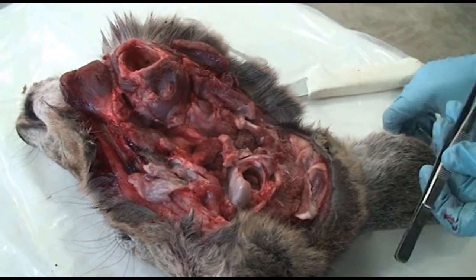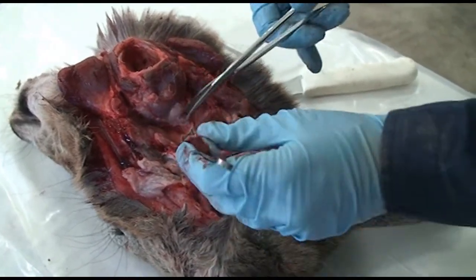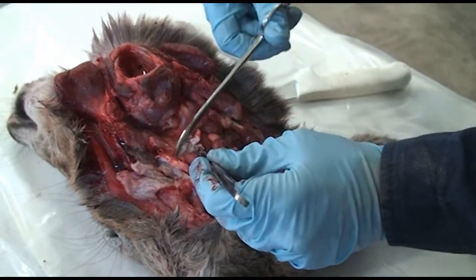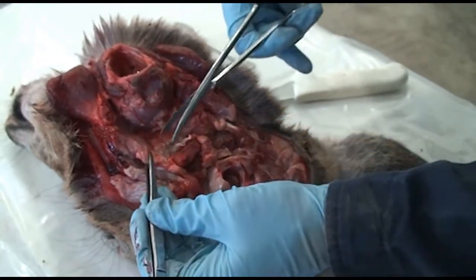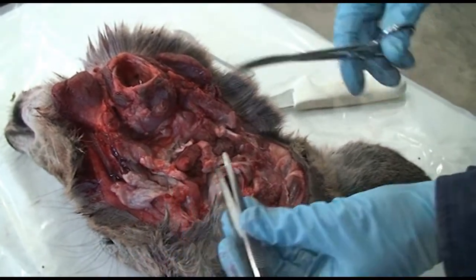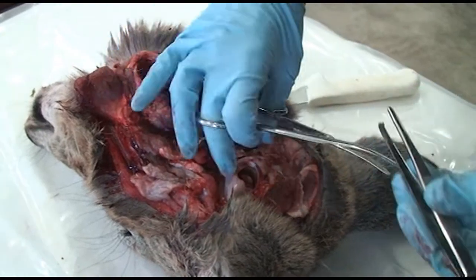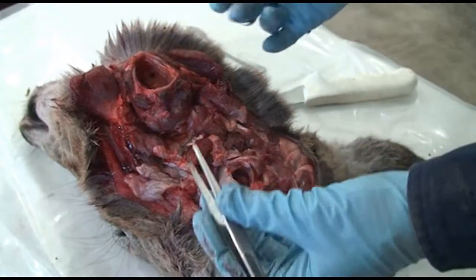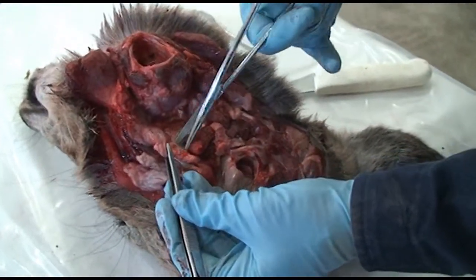And so I like to use my scissors and dissect down to the lymph node till I see that capsule, and then grab a hold of it and dissect it out. Some people like to use a knife to get the retropharyngeal lymph node out. There'll also be lymph nodes when you're taking the head off. You may see lymph nodes sitting right underneath the jaw, right after you skin it. Those are submandibular lymph nodes, and those are not the lymph nodes that we're looking for.